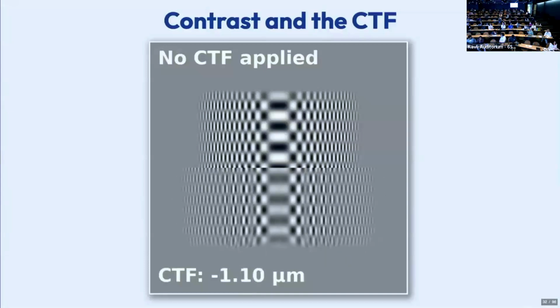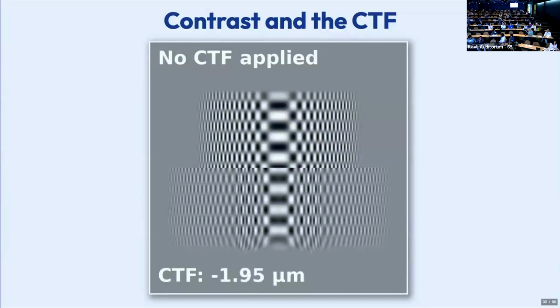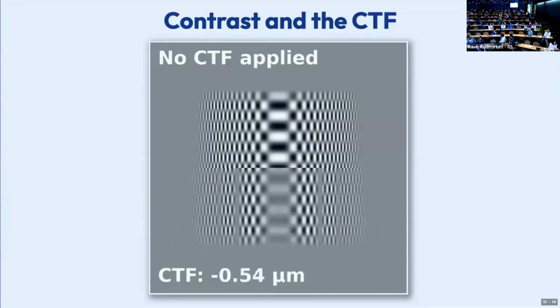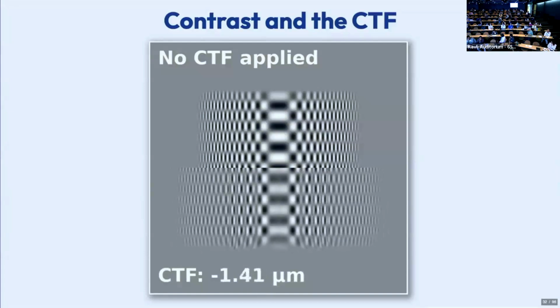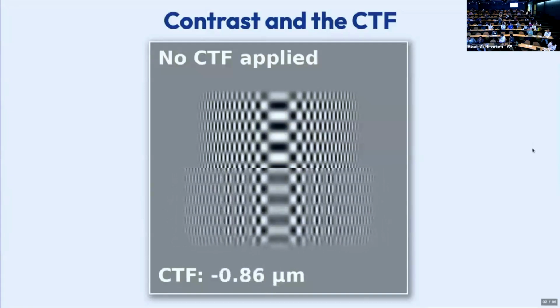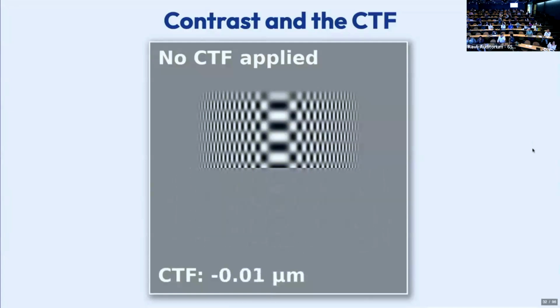I wanted to go back to the defocus again. Say you have a protein, one rigid part and one floppy bit. The rigid part is easy to get, but for the floppy bit, how should I change my defocus to actually be able to see it? Yeah, that's a good question.